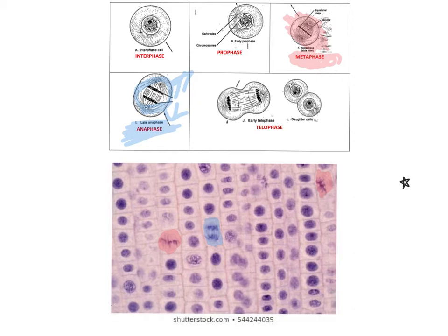I'm now going to go to the ones that are a little bit more tricky. Those two are the easiest to identify. And I'm going to identify telophase. I'll know telophase because I can clearly start to see two different nuclei within the same cell. So here, I have a cell where I can see that there's two nuclei in it. Here is one as well. So it's one cell, but there are two blobs in it, meaning two nuclei in that cell. To me, those are the only ones that I see. Oh, maybe this one. So you're going to have to make some judgment calls and do the best that you can. So those to me look like all the ones that are in telophase.